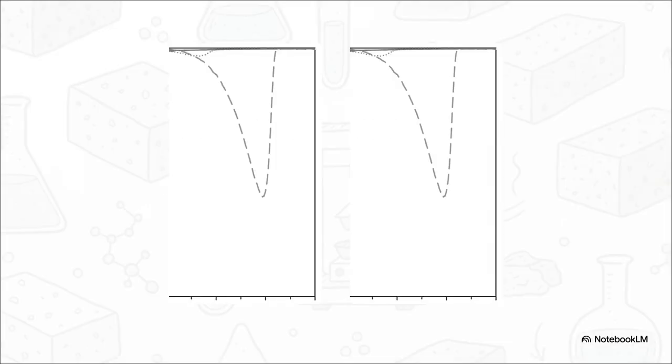And this just illustrates the concept perfectly. I mean, just look at the difference. Portlandite gives us that sharp signal around 460 degrees. But another common component, calcite, you might know it as calcium carbonate, doesn't break down and release its CO2 until much, much higher temperatures, somewhere between 600 and 800 degrees. Two totally different suspects, two totally different fingerprints.